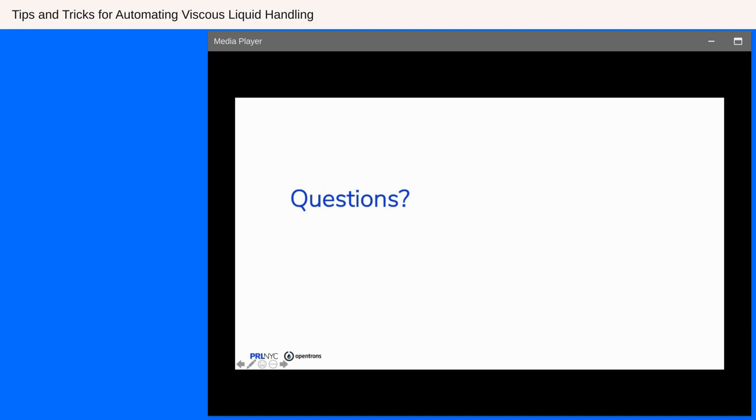Great, thank you. One more question. Where can I find the app note you mentioned? Will it be included in the follow-up email? Sure, yeah, we can send out the app note in the follow-up email, but a good idea would be to look for it in the app note section on the Opentrons website. You'll be able to find the app note for viscous liquid handling there. Keep an eye on the documents section of the Opentrons website.